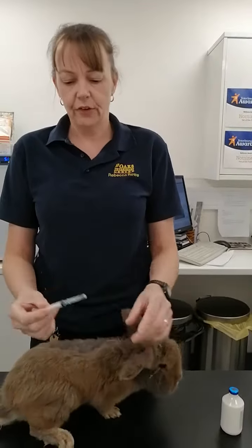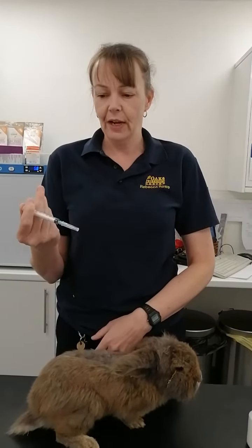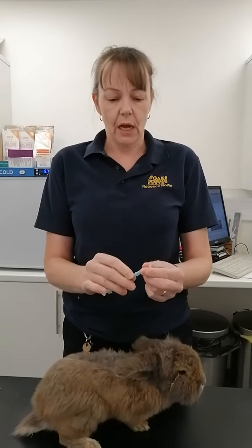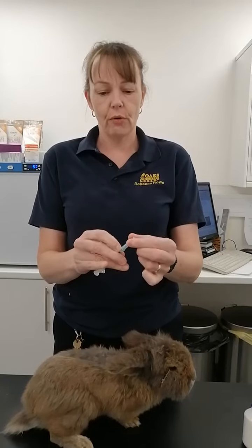We always handle a syringe not like they do in the films — holding it as if you're going to inject straight away — but like a dart or a pencil, and near to the needle so that you've got more control of it.